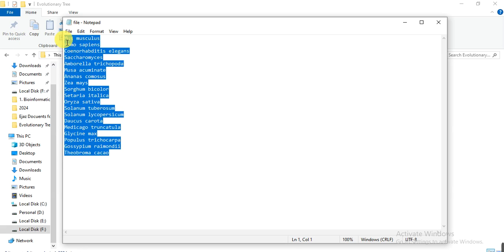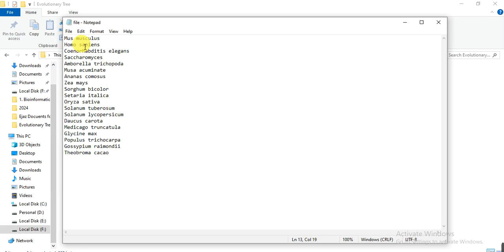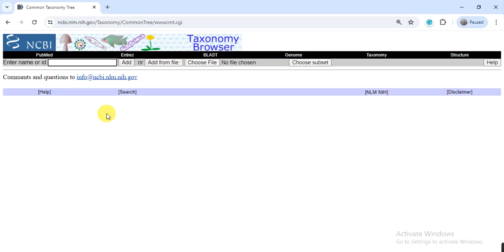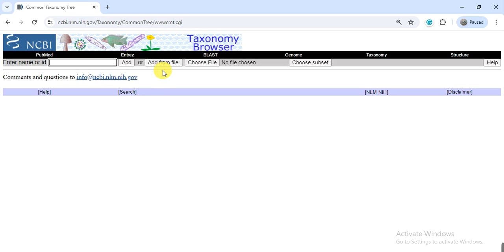Now we open the link. Here, this is the link about the taxonomic tree or taxonomic browser through NCBI. The link of this website is available in the video description. You can find it from there. Now simply go to choose file. Here you can see choose file. When you open the link, you will find this window.